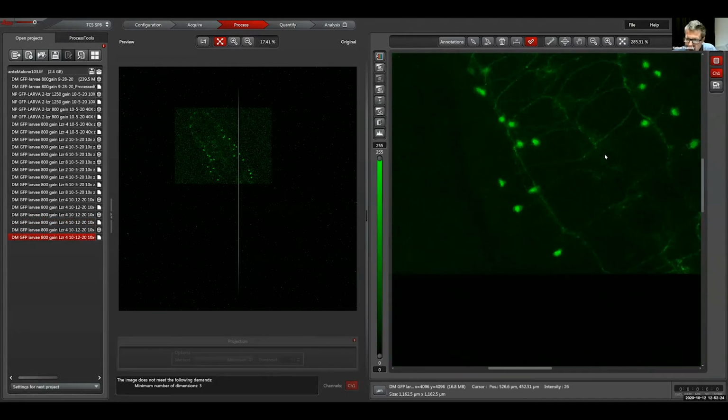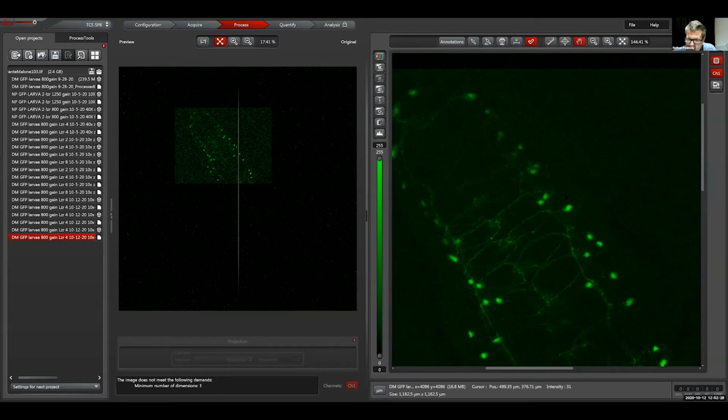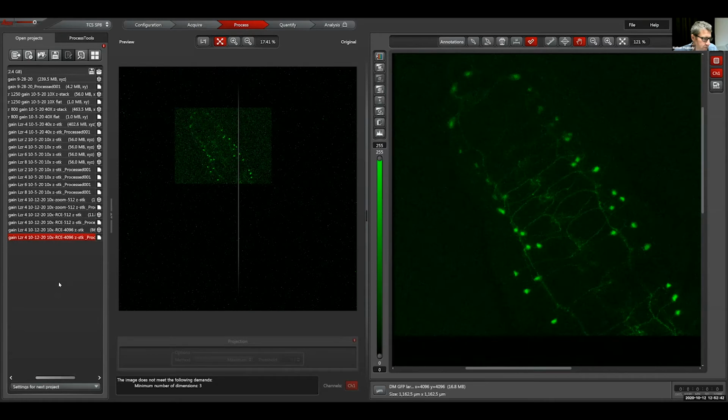Yeah, this one works way better with the... All right, so I'll put these in your folder, but basically compare this one to the 512 one. I'm going to click on the other one you did, which is 40x, way up here, laser 4. Okay, you ready? Just look at the picture and it should be more or less the same region.